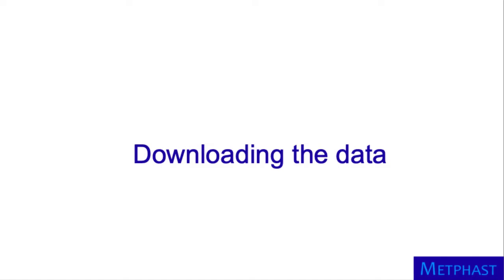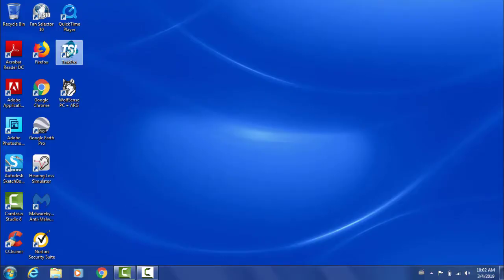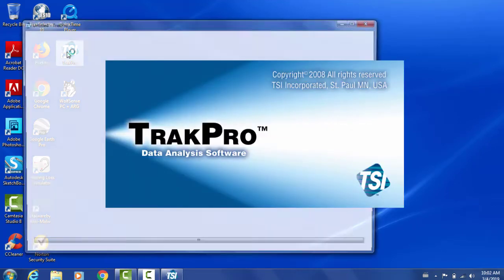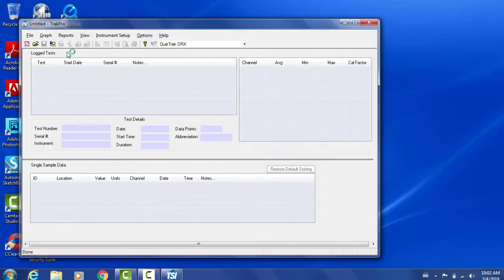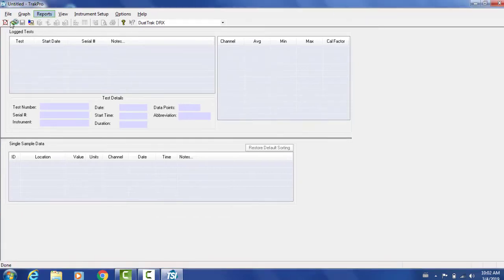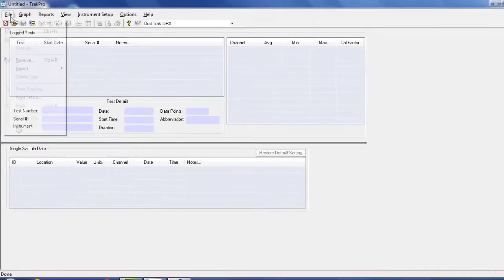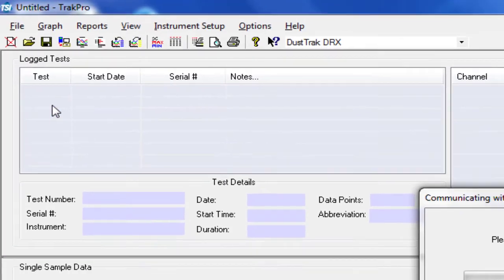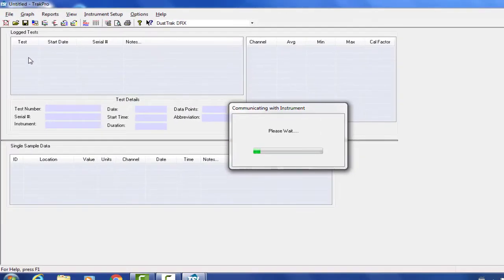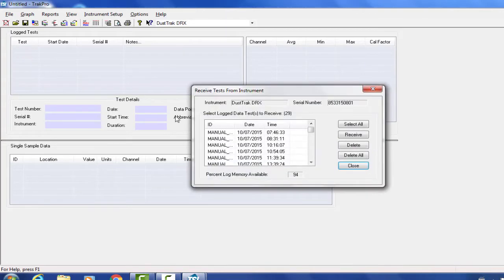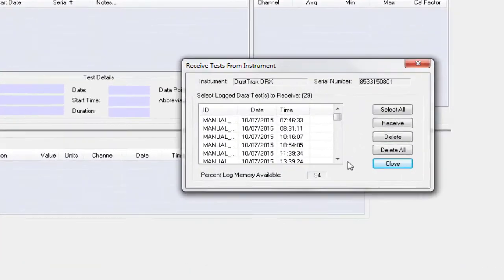Now I'll be downloading the data from the instrument into my computer. To do this, I need the TSI software. It's already installed on my computer. So I will go ahead and open it. The instrument is also connected to the computer at this point. Then I'll go ahead and click File, Receive. What is happening right now is that the instrument is communicating with the software. And the software is extracting the data.